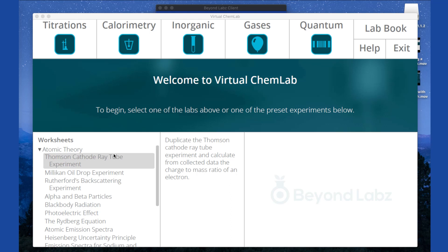The worksheets provide detailed procedural instructions that will help you when you enter into a specific worksheet preset. They'll tell you what to interact with and how to click on and move different parts of the lab so that you're going through and doing your actual lab experiment as you go through.